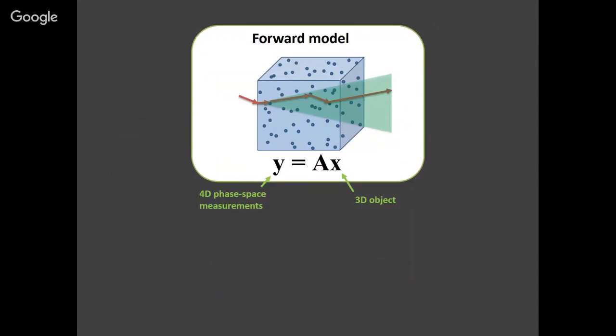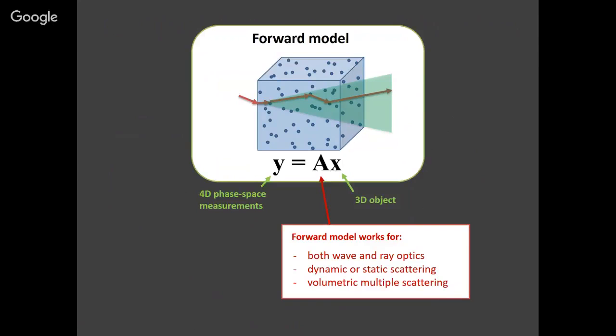You take these measurements, you're trying to solve for the 3D positions of the point sources, however many there are. Basically, you try to solve for the intensity in all the 3D points, given that each point would create a blob in 4D phase space of a particular tilt angle and spread. So this is a great forward model.